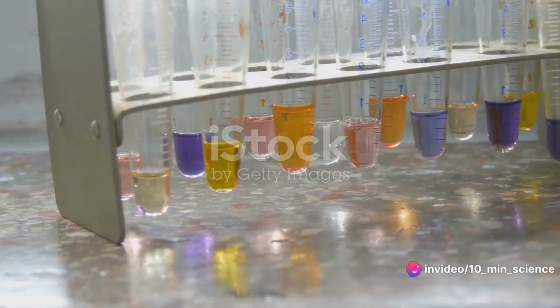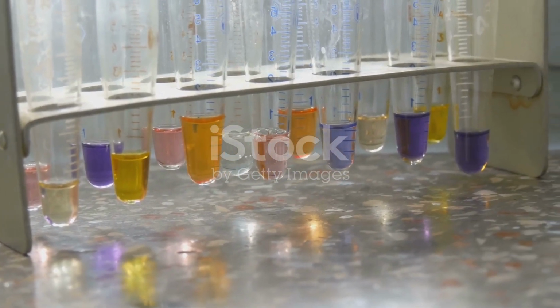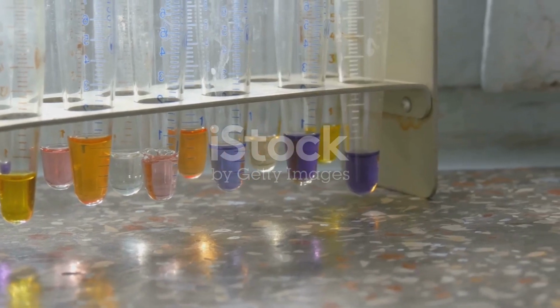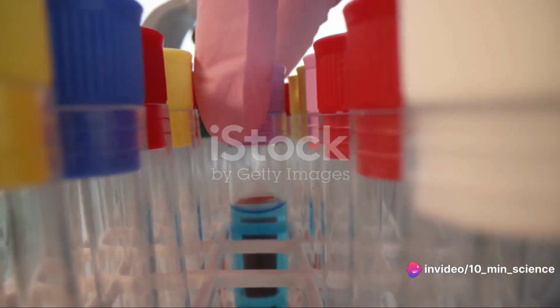Lastly, we have the flow rate. This is how fast your mobile phase travels through the column. A slower flow rate gives the analytes more time to interact with the stationary phase, improving separation. However, it also increases the time for the run.